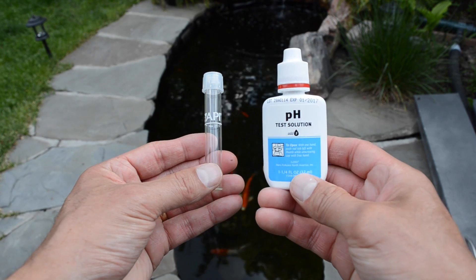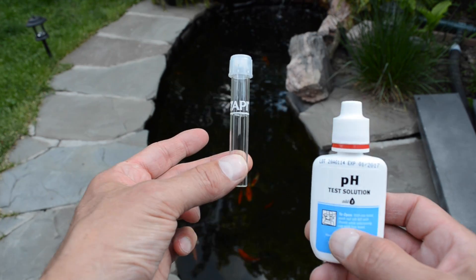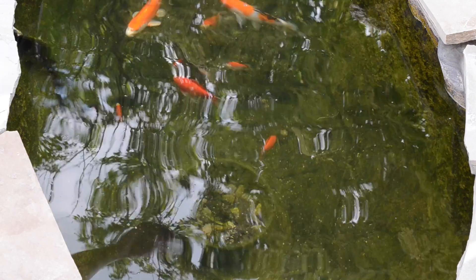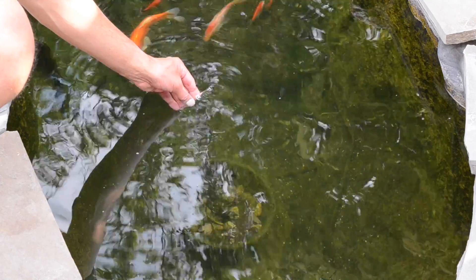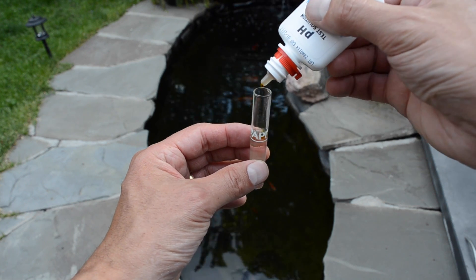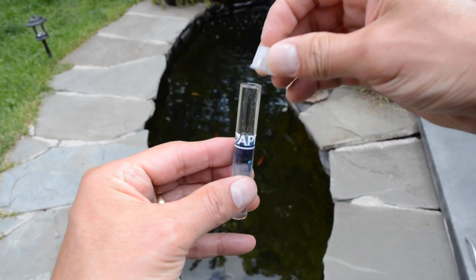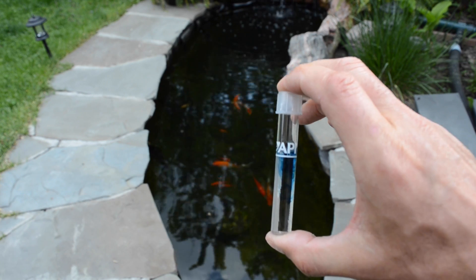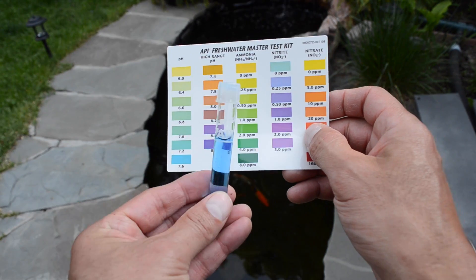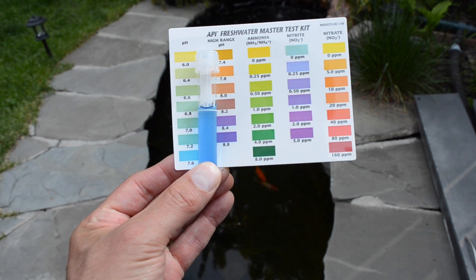We're going to start with the pH test solution. The first thing I'm going to do is take the test tube and fill it up with about 5 milliliters of water up to the fill line, then add three drops of this solution. Put the lid back on, give it a good shake, and hold it up against the pH chart to see what color the pH is reading.